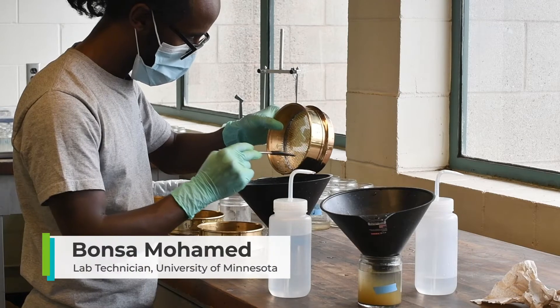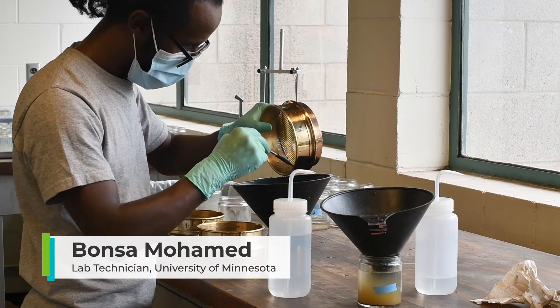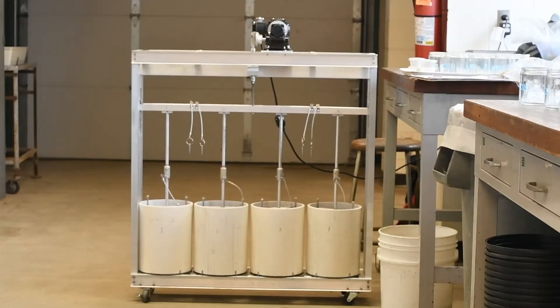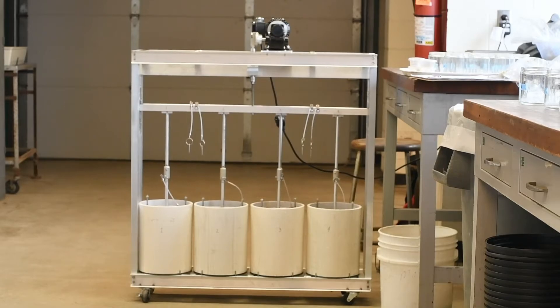In this video, we'll follow UMN's lab tech, Bonsa, as he walks us through one soil health indicator, aggregate stability, and one Science of Soil Health method for evaluation using a modified yoder device. On paper, this method can seem pretty complicated, but hopefully by the time we've walked you through it, you'll be running it yourself.